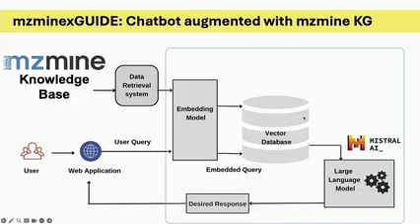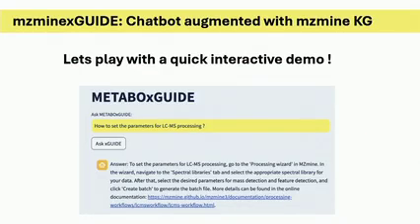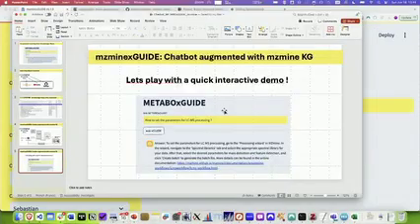So if you have tried ChatGPT on your research project, you might have observed that it doesn't know much about detailed software or even less about the experimental data. So here we are providing some information, context, that will help the large language model to provide some meaningful answer. And it's my pleasure to present you a quick demonstration of this.